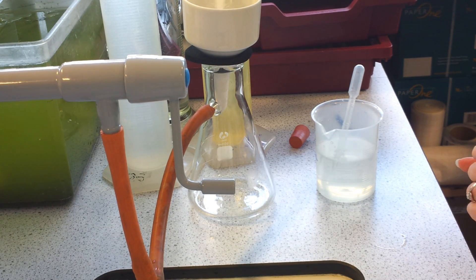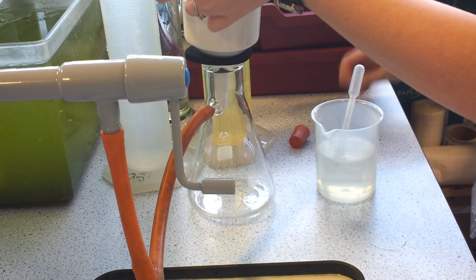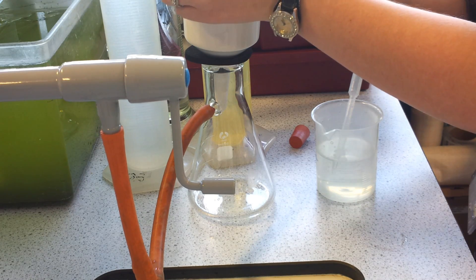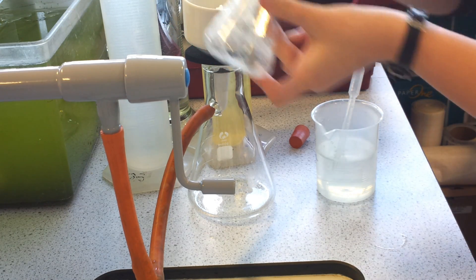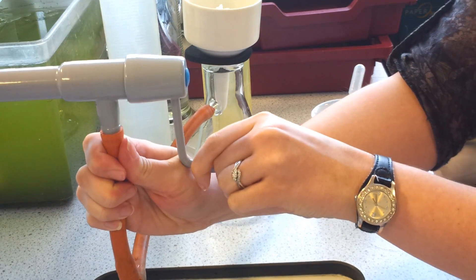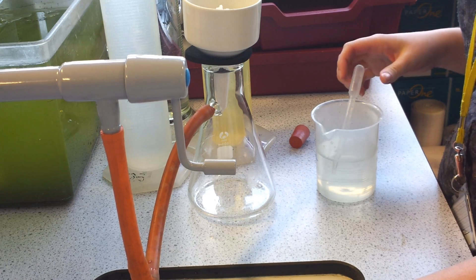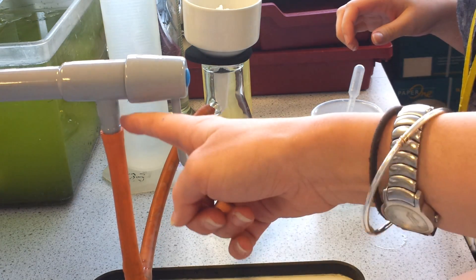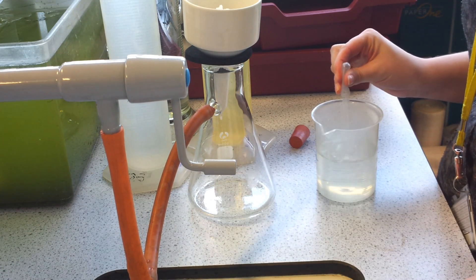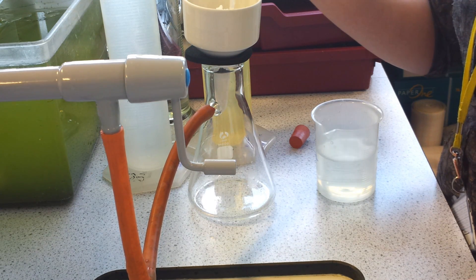Once the mixture has been in the fridge and crystallisation has occurred, you get a white solid. We're going to put it into a Büchner filter and wash it through with some ice cold water. The Büchner filter works by causing suction — the water goes straight from the tap down into the sink, and that is pulling air through the other tube out of the Erlenmeyer flask, forming a vacuum and pulling the product down with it.